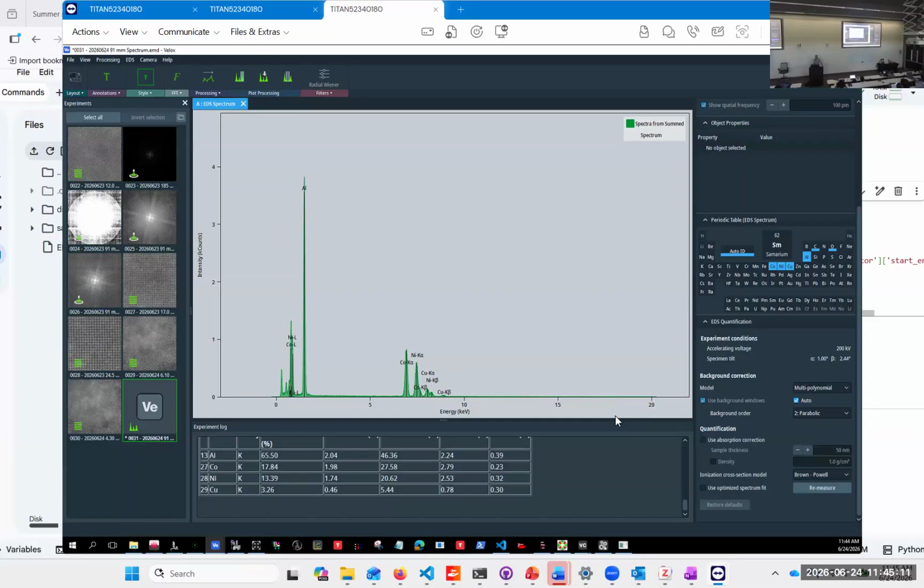They work very well for the K edges, and L, M, and so on are a bit more dodgy. If you compare the same thing with strontium L instead of strontium K, you will find a large deviation.